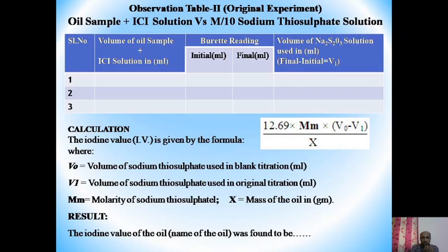Before starting the titration, record the initial burette volume. After titration, at the end point, record the final volume of sodium thiosulphate. Final volume minus initial volume gives the exact quantity of sodium thiosulphate used. Take three or more readings — more readings give a more accurate result, though three readings also give a reasonably accurate result.